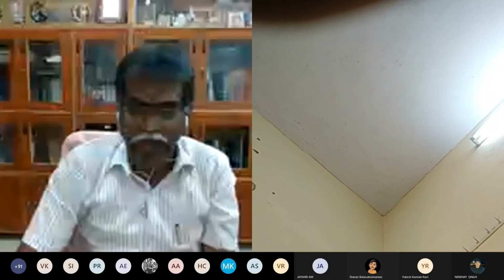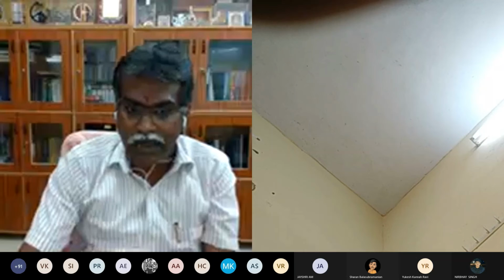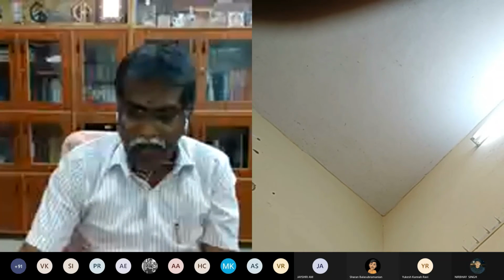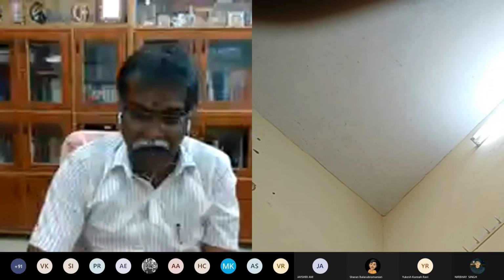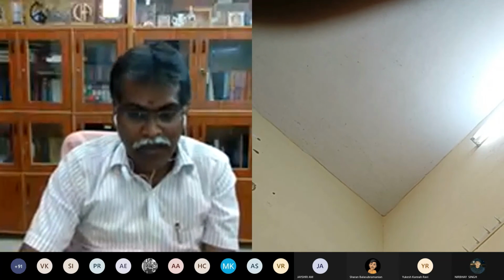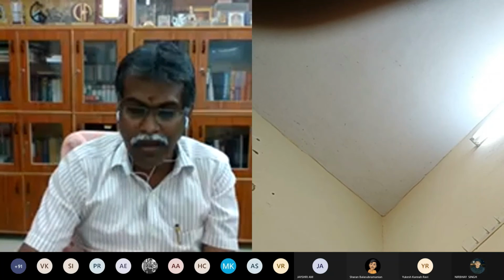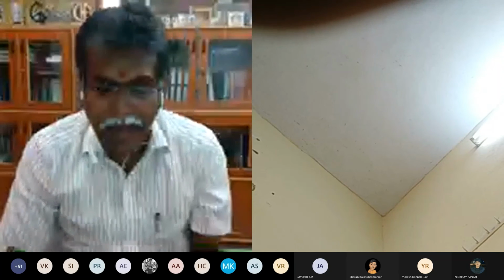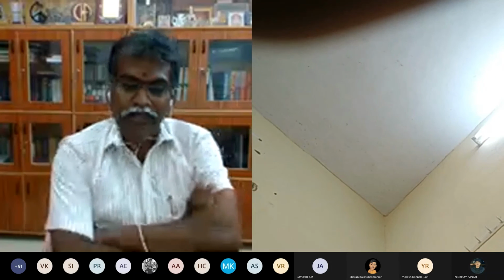Once the instrument is calibrated, now you can go for testing of the sample. So you have an unknown sample with you now, and take the sample in the cuvette up to the mark and place it inside the turbidity meter and wait until you get a stable value and note down the turbidity of the sample with the turbidity meter. Okay, so please make a note that calibration of the instrument is very much important. One is this preparation, calibration, and your testing of your water sample.